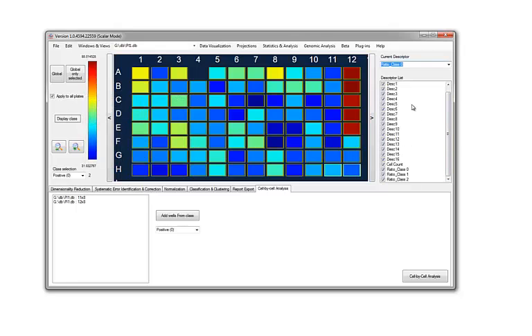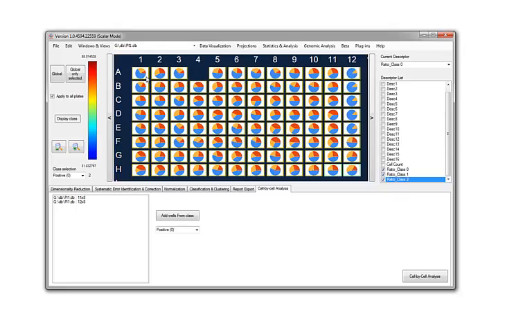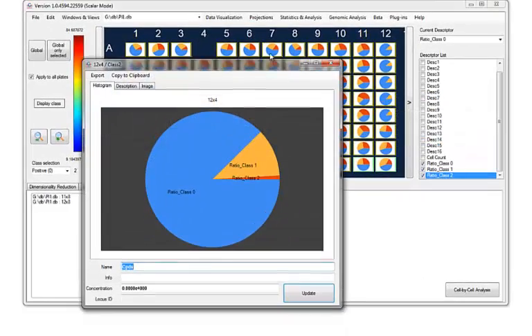So there's a real nice way to display those results, to see the different ratios of these populations. What you do is you unselect everything and you just select the 3 ratios of interest, and then you move to the pie view. And as you can see, we have a pie representation of all the different subpopulations. So this pie view is automatically updated when you are removing or adding a new descriptor, and it gives you an idea about which cell population is important compared to the others. When you click on display information about it, it displays also this.